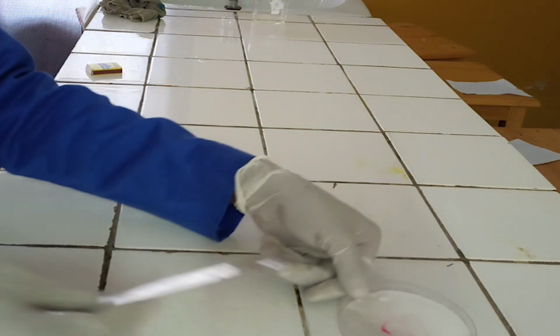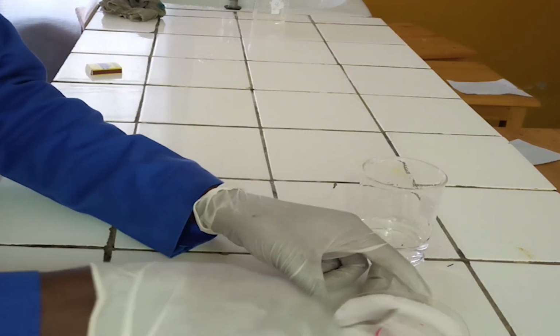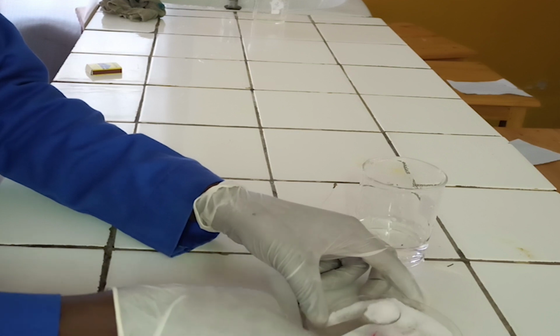Test for chloride ion. First step, dissolve a spatula-full of analyte salt in 50 ml of water.